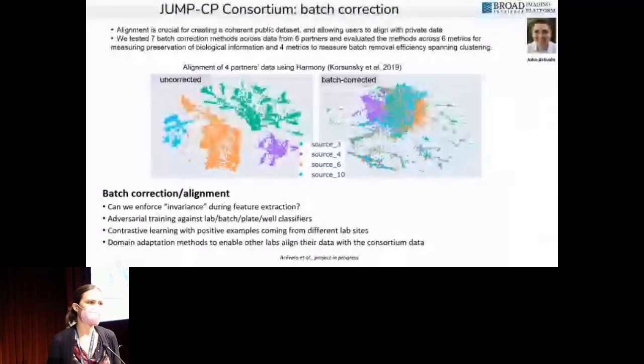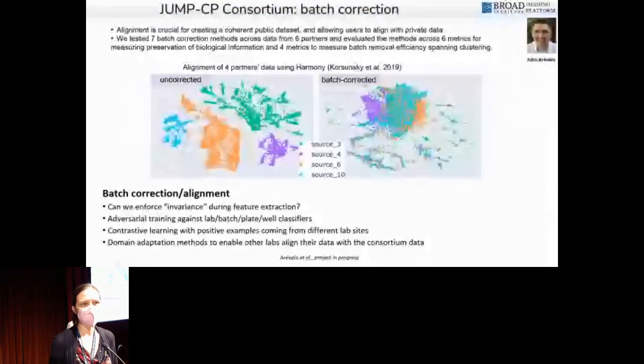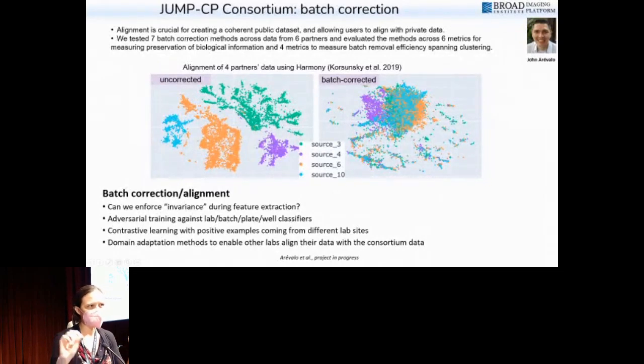Usually the limitation is the physical limitation of how long it takes to capture the images or create the samples, if you're talking about 3D organoids. We personally haven't done experiments that use those two data types in this kind of profiling way, but it could absolutely be done, and I've seen a few inklings of people starting to do that work. I think we're in the low-hanging fruit stage, and there's been plenty of low-hanging fruit with the 2D static images, but I think that'll be a direction the field is moving towards.